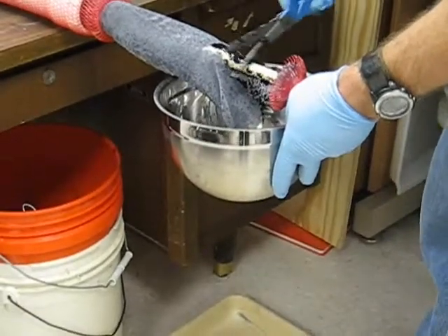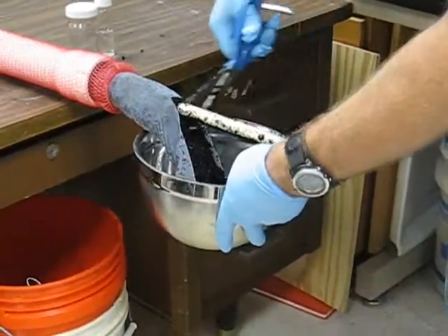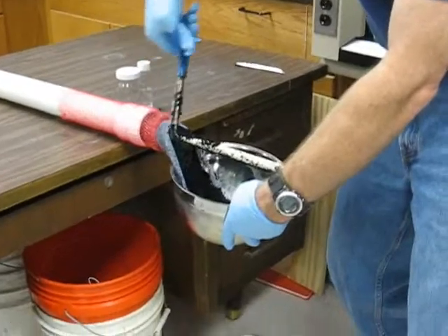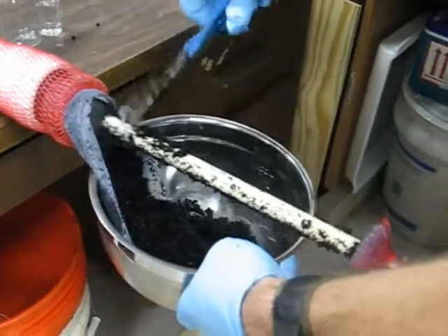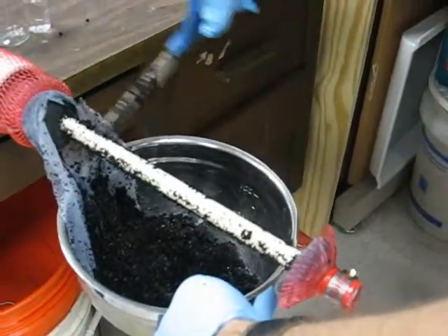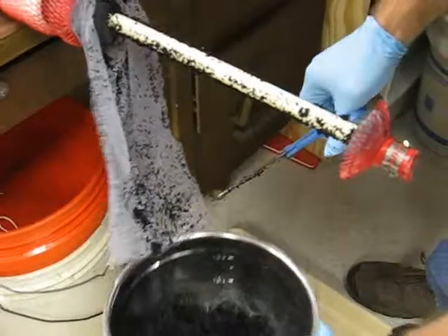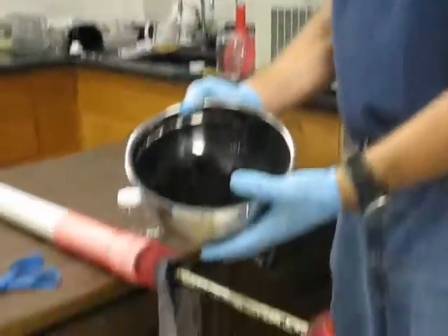I'll typically use the scissors to scrape the carbon off the center tube as I'm cutting up the sock. Right here you can see and feel the rubber washer that was in there during construction — that represents the interval we're interested in. We want all the carbon from the bottom to this first rubber washer, scraping as much off the sock material as possible, and we end up with all of the activated carbon from that interval.